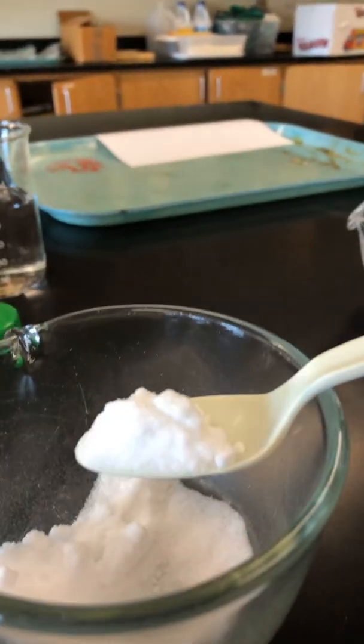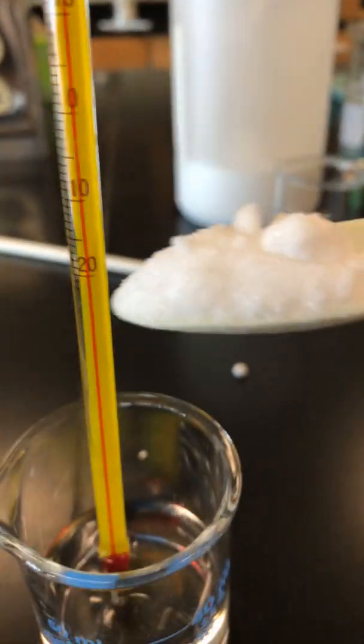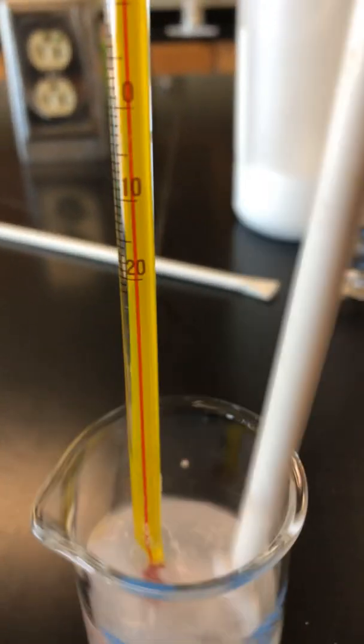Okay, so now, same technique. I am going to add a scoop of salt B to our beaker. There it is. Use a clean stirring rod, and I'm going to stir it around.